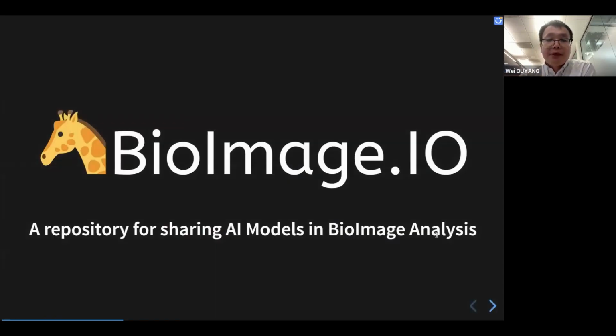With this, we also started another track, which is the Bioimage Model Zoo. The aim is that, besides the platform effort, we also work on building a model repository to be able to share AI models with the bioimage analysis community. There are a lot of reasons behind that. Training is much harder, and with this kind of repository, you can share models without retraining, because training models is very difficult. It requires complex software setup, complex hardware like GPUs, and expertise in organizing the data. There's a lot of pain in training your own models, right?